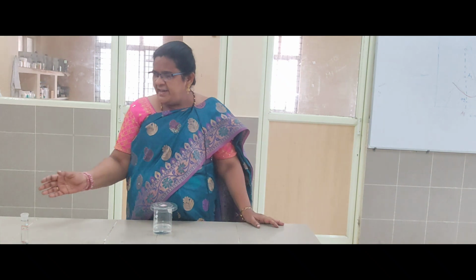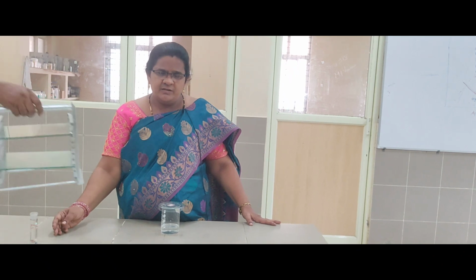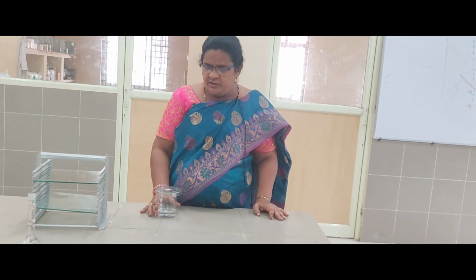We are preparing the mobile phase in a small beaker because we require only 100 ml. On a large scale, the development chamber is used. This is the development chamber, where the mobile phase is saturated.